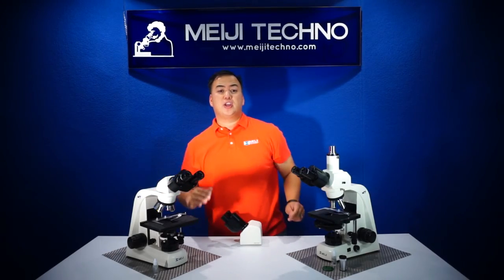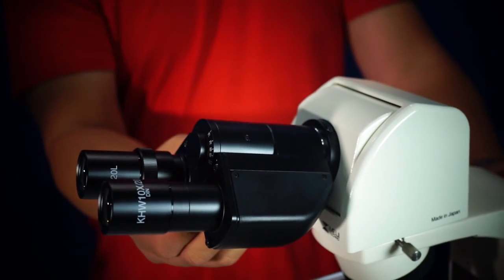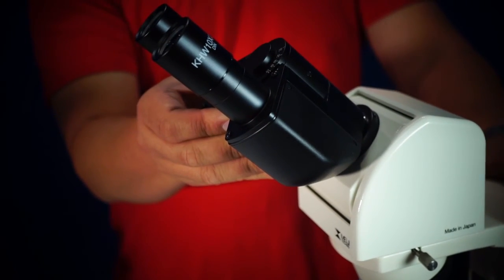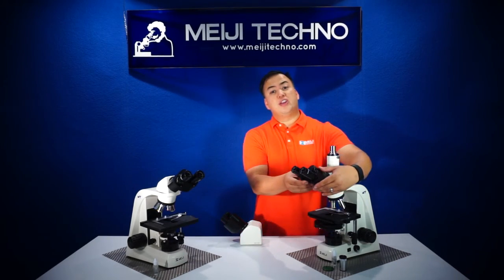Very ergonomic in terms of its angulation. The MT4000 also has an optional ergonomic binocular or an ergonomic trinocular head that can be adjusted from 10 to 50 degrees. All heads have an interpupillary distance from 53 to 75 millimeters.